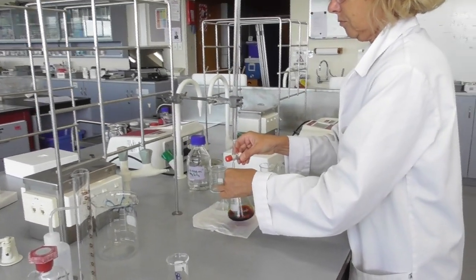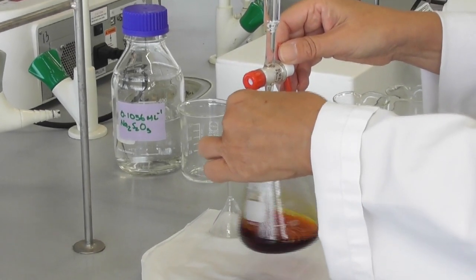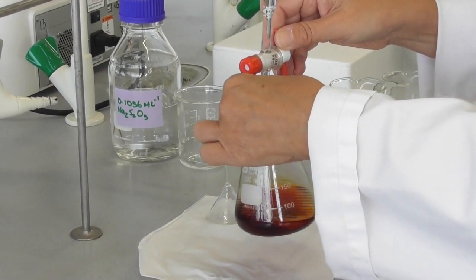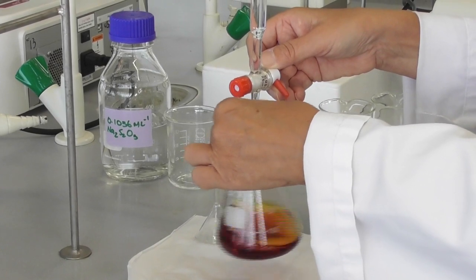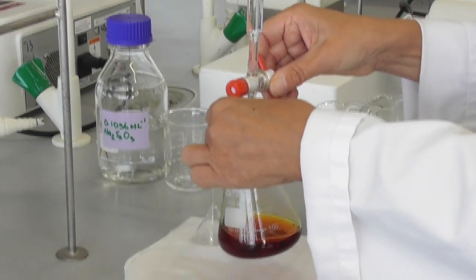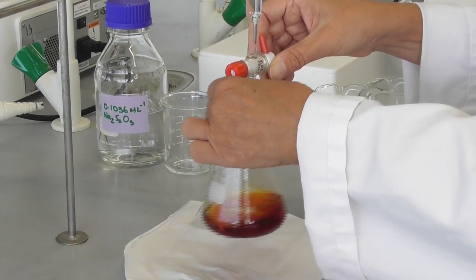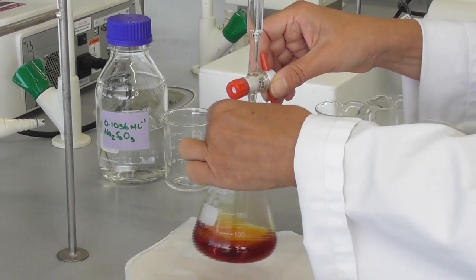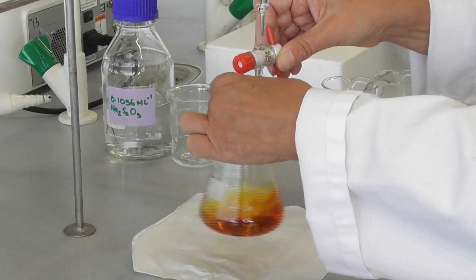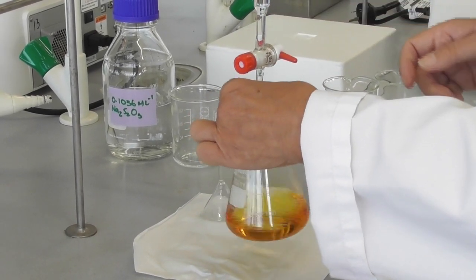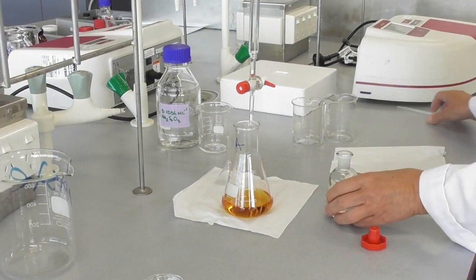I have now started my titration. I have removed the waste beaker from underneath the burette and am holding my flask that contains my peroxyborate and potassium iodide in the hydrochloric acid solution. I slowly add the thiosulfate solution while constantly swirling my flask to ensure that I have a good mixture at all times. The color will go from brown to orange to yellow, and when it turns about yellow I add my indicator.